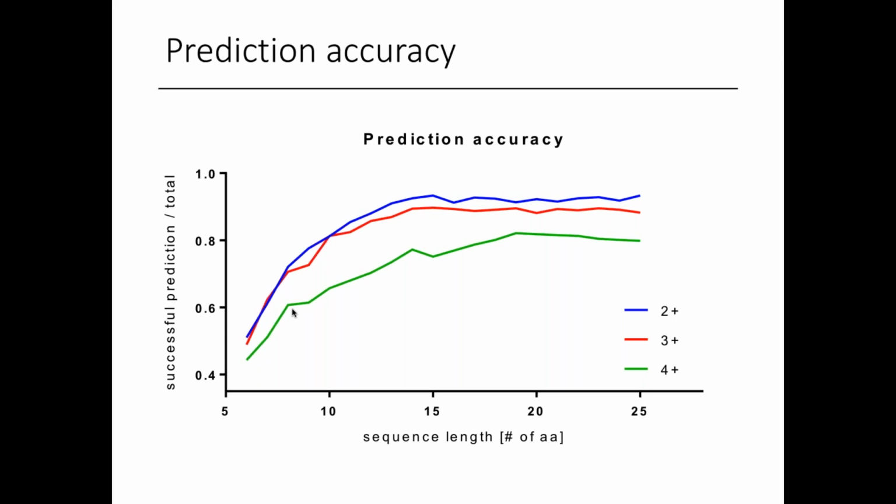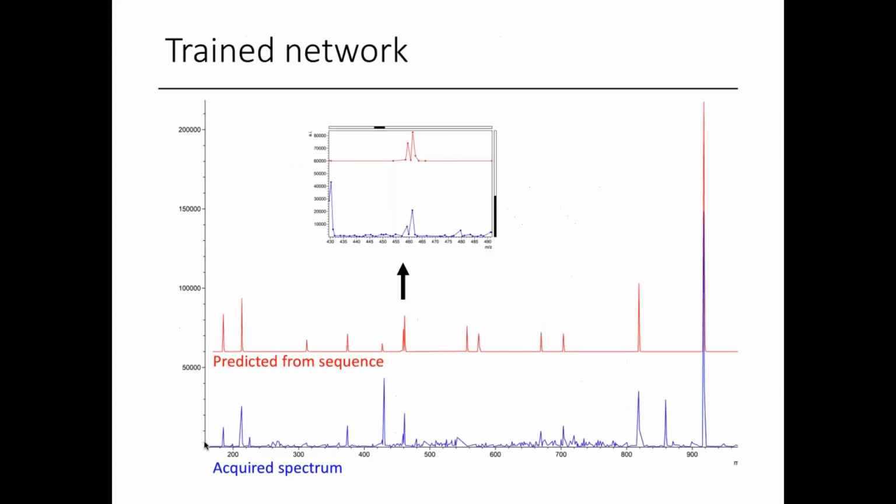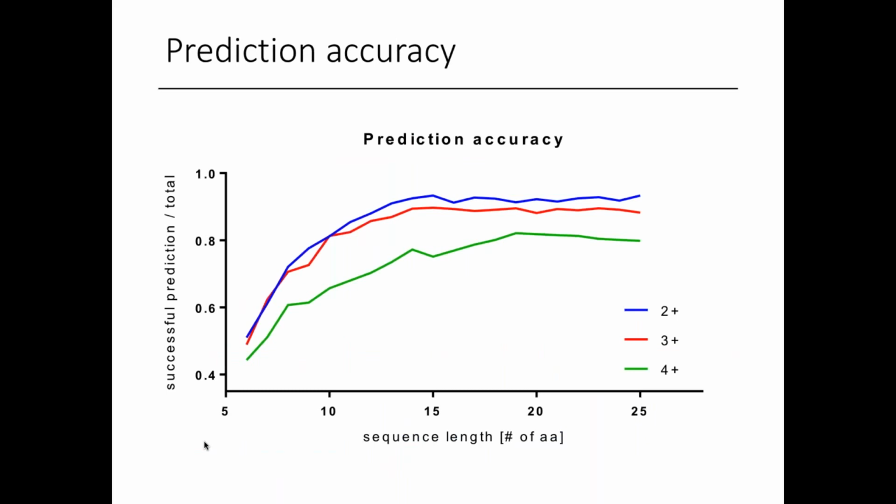I think there are different guesses, but my guess is that since we use a minimum sliding window of about 5 amino acids, as in the previous slides, where we slide one amino acid at a time, to get a sequence of 5 data points you'll probably need 10 amino acids, and to have 10 data points you need almost 15. So that's one thing.